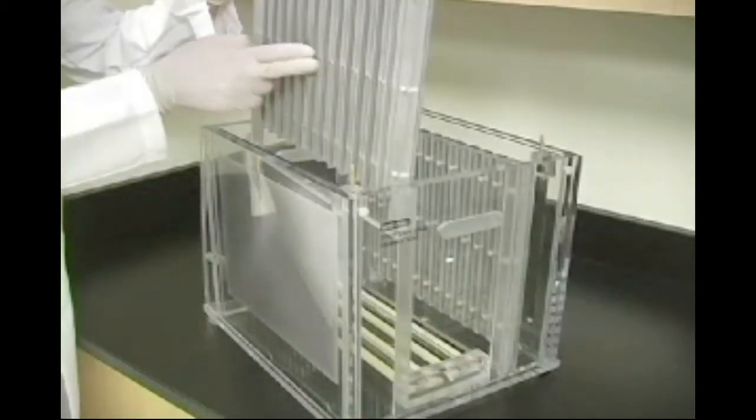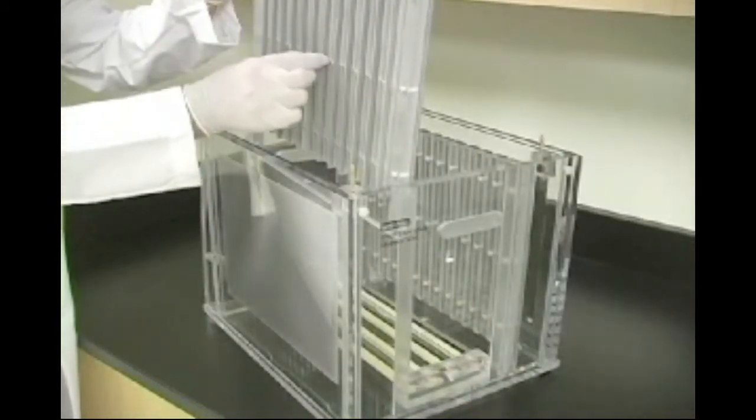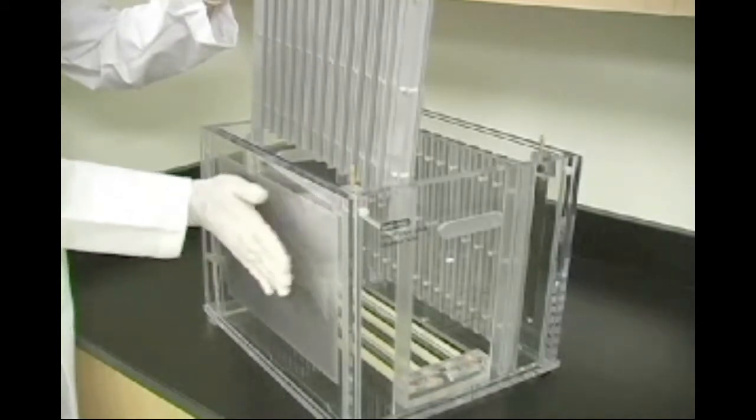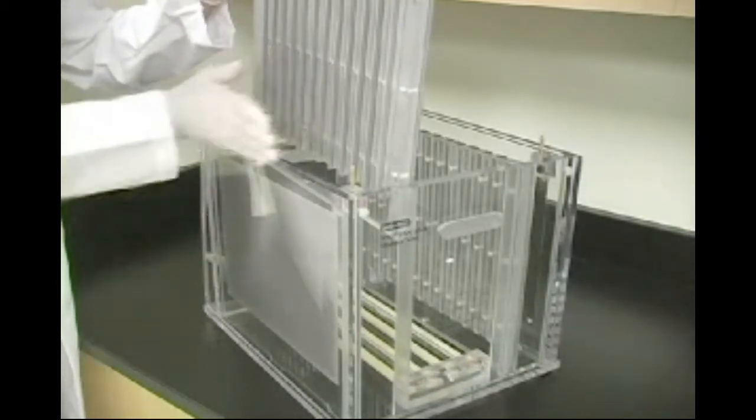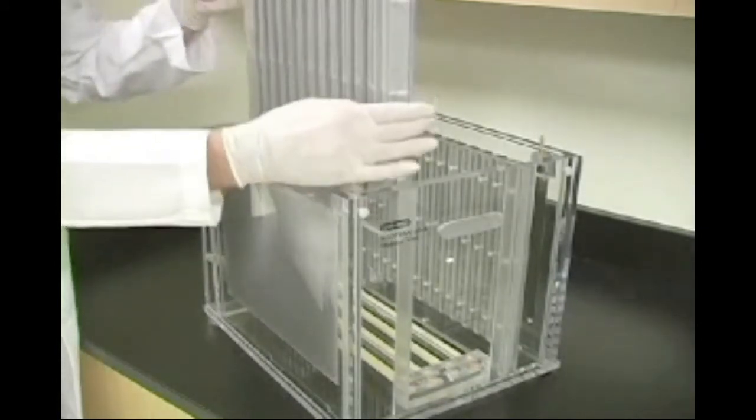To replace the gasket assemblies in the proper orientation, make sure the side with the rubber gaskets are placed so that the gaskets are facing outward toward the plate electrodes.